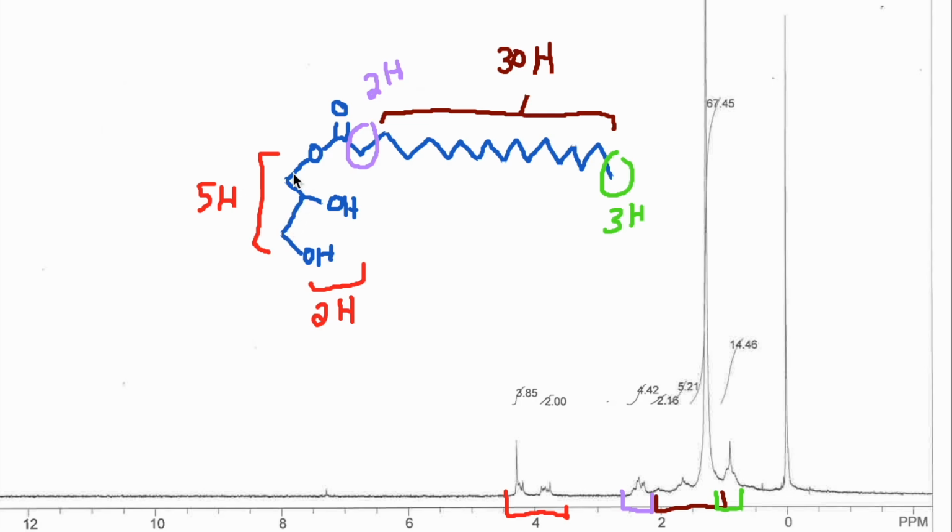These have neighbors. These protons have slightly different chemical shifts because they're different. This one's on the carbon that has the ester, this one's on the carbon next to it, the carbon that's 2 away, so they're not exactly equivalent like a methyl ester biodiesel signal would be. So we do have some splitting, some more complexity here, and some different chemical shifts. So we have a more complex signal down at the 4 ppm range.